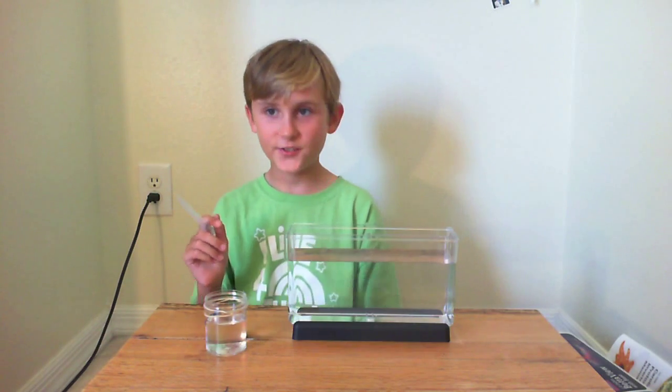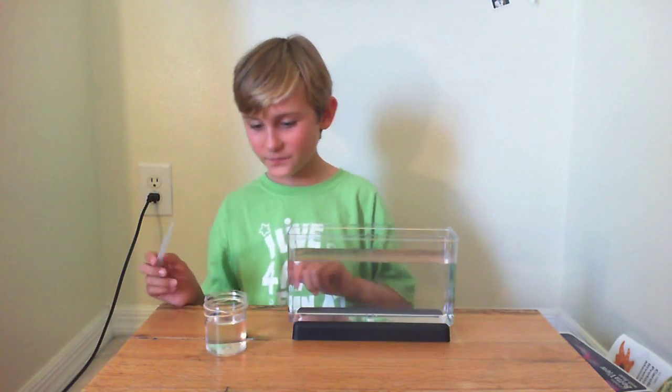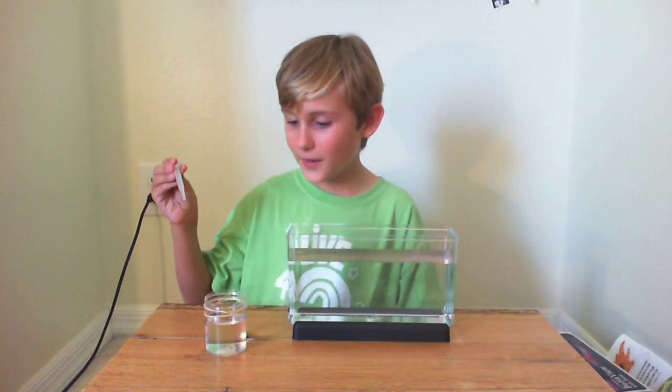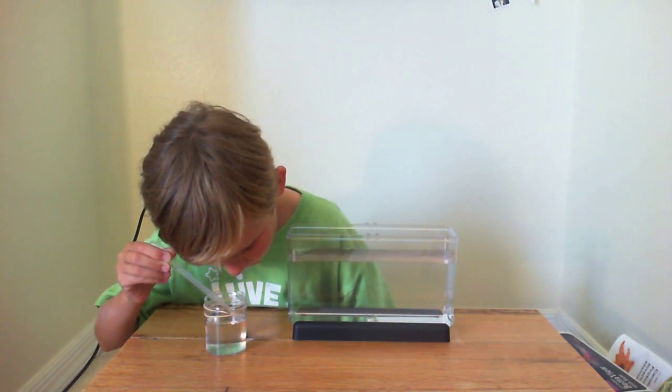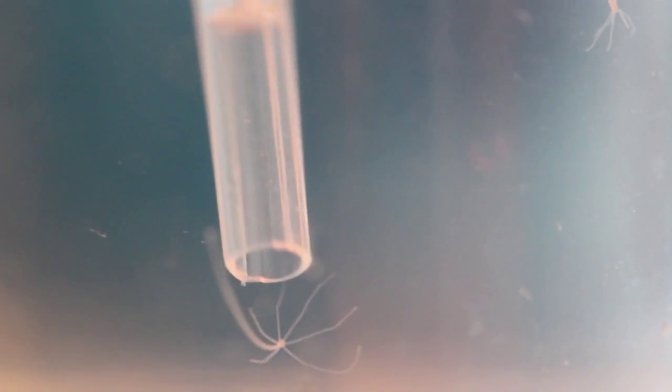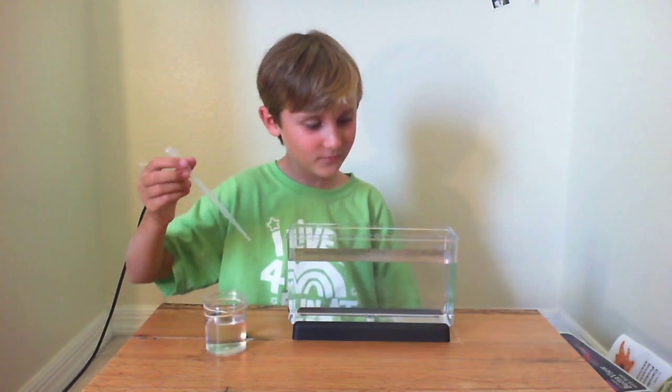Introducing the Hydra to their home is more tricky than with the Daphnia. I went ahead and poured in the water as well. Use the pipette to gently suck in a dozen or so Hydra and use it to transfer them into their aquarium. Repeat as many times as you need to to get all the Hydra.